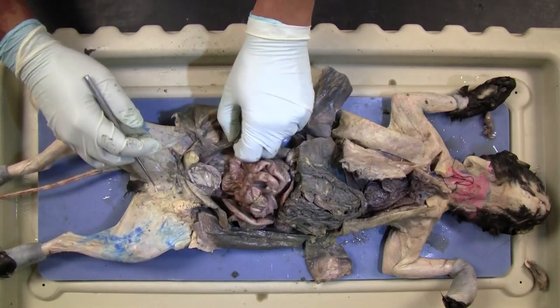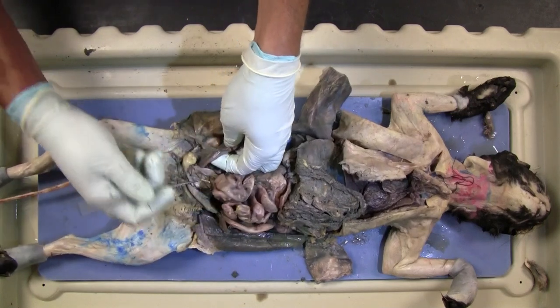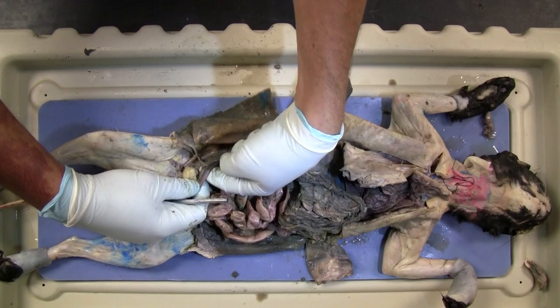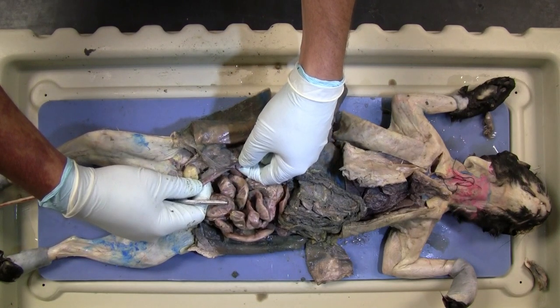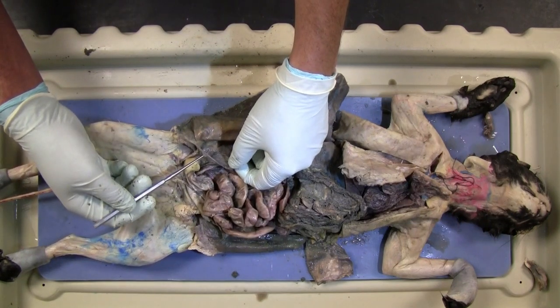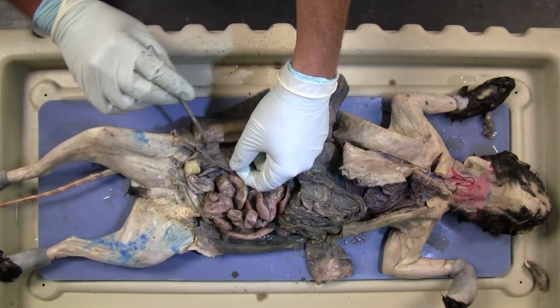Now one of the trickiest ones, if you have a female cat, you grab this is the uterine horn, and all of this down here is your broad ligament. Your broad ligament runs the entire length of the uterine horn, and the round ligament runs perpendicular to it. So here's your round ligament, there's your broad ligament.